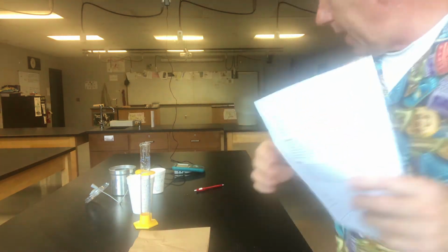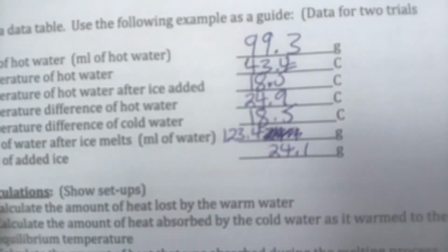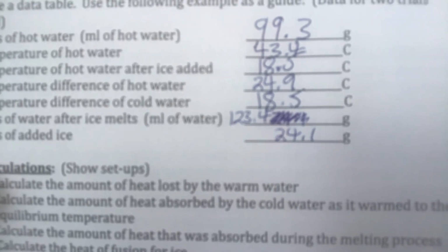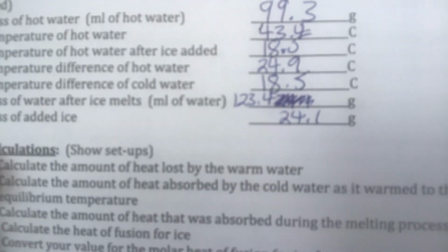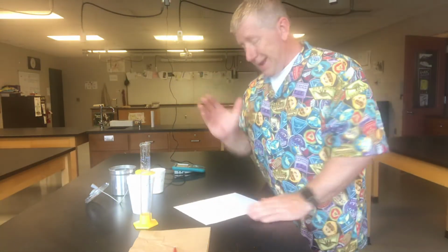So here's what it looks like. I did state earlier, I was mistaken. I didn't put a spot in the data table for it, but I did. I just forgot I did. Where are we? Here we go. So that's what we look like. So the mass of the water and the ice cube after it all melts, 123.4. Subtract those two, we get the mass of the ice cube as 24.1. All right, data table for trial 1 is now complete.